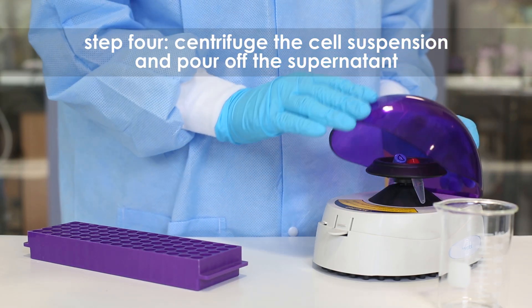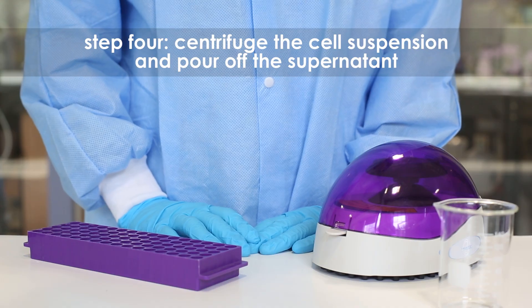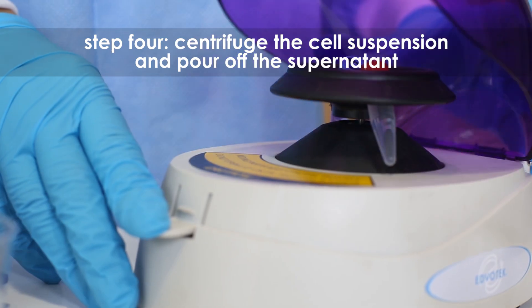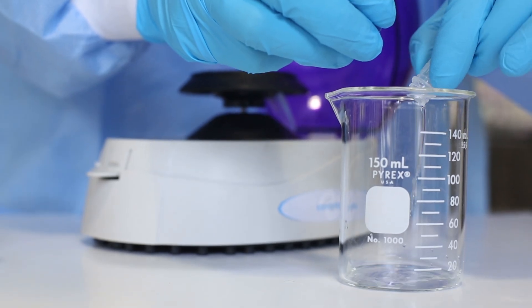Step 4: Centrifuge the cell suspension for 2 minutes at full speed to pellet the cells. Pour off the supernatant. Take extra care not to disturb the cell pellet.